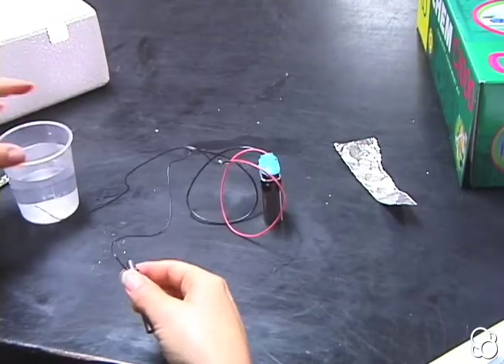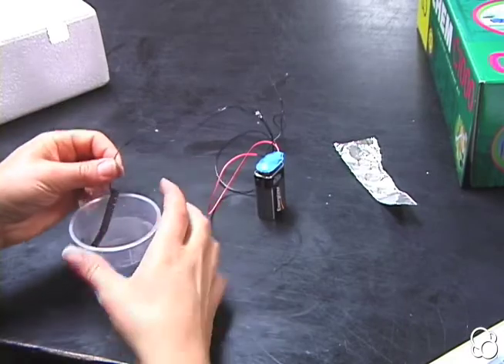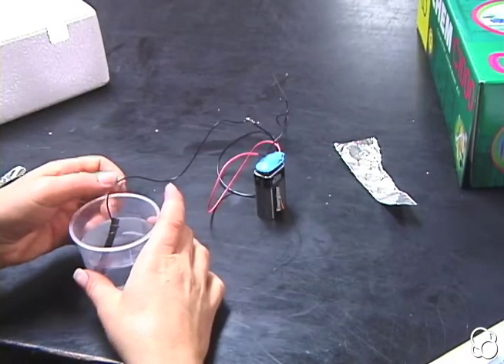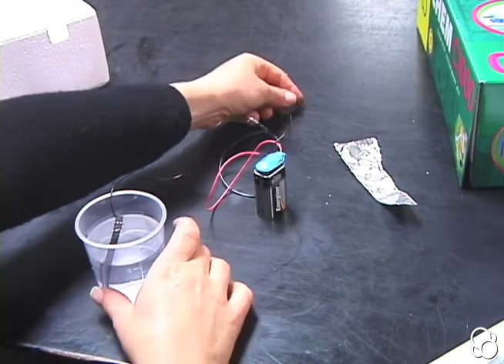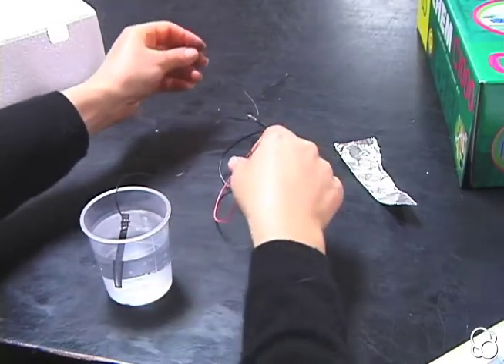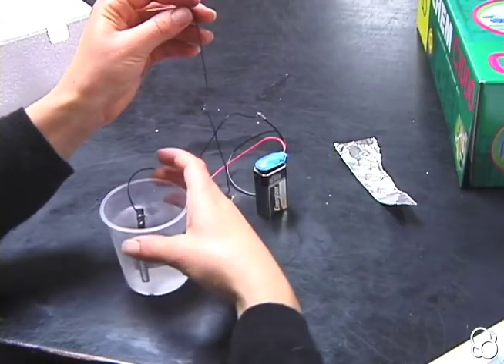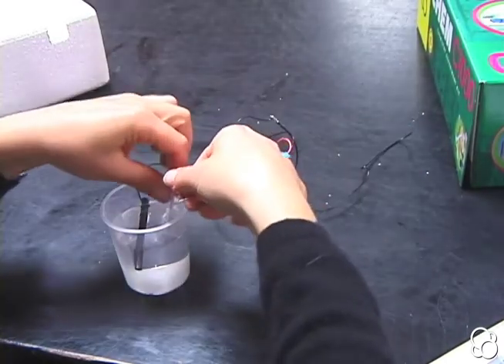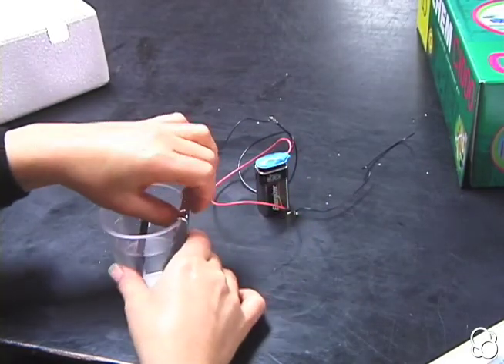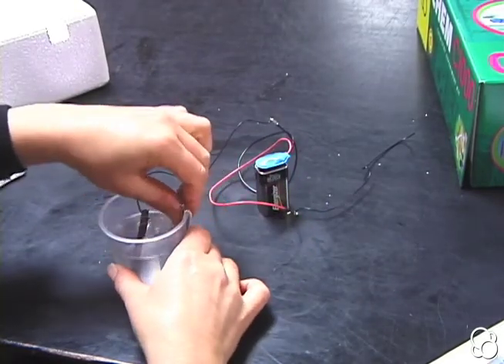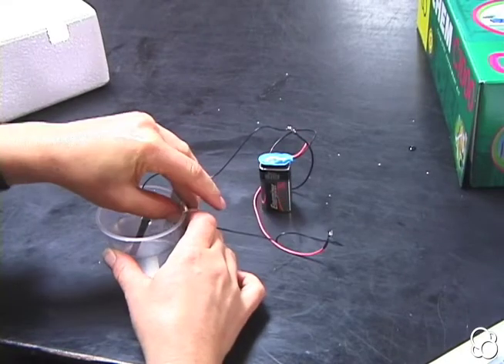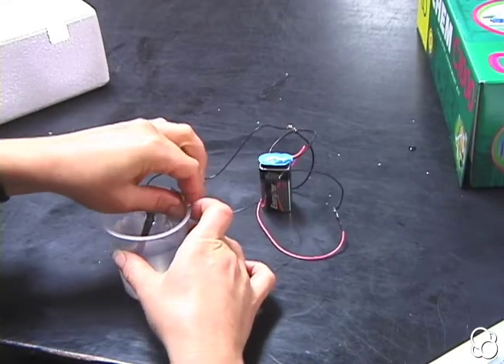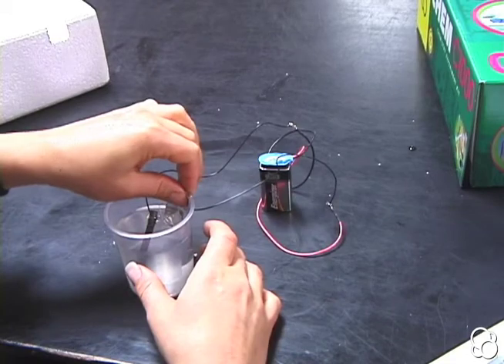Then we're going to put the carbon rod into the solution, and the other end we're going to connect with a piece of aluminum foil. We're going to stick the aluminum foil into the solution as well. You can press it against the wall and connect the wire by folding it over like this so it'll stay in place.